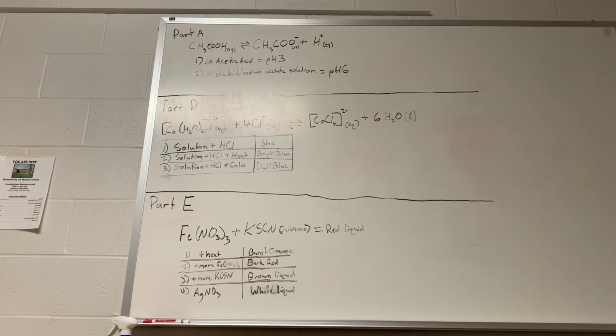So in part D, the solution plus HCl was just the solution plus HCl, and then the second one was just the original solution plus HCl plus heat. That concludes my presentation.